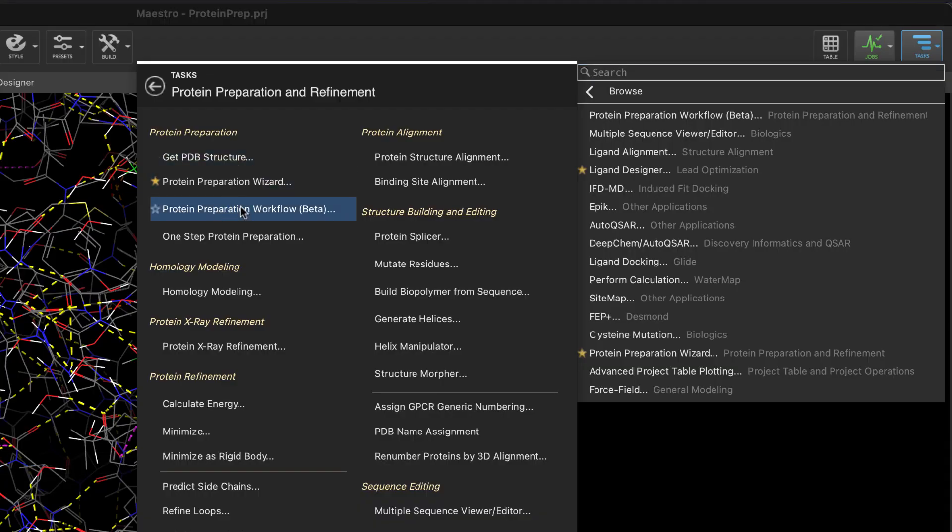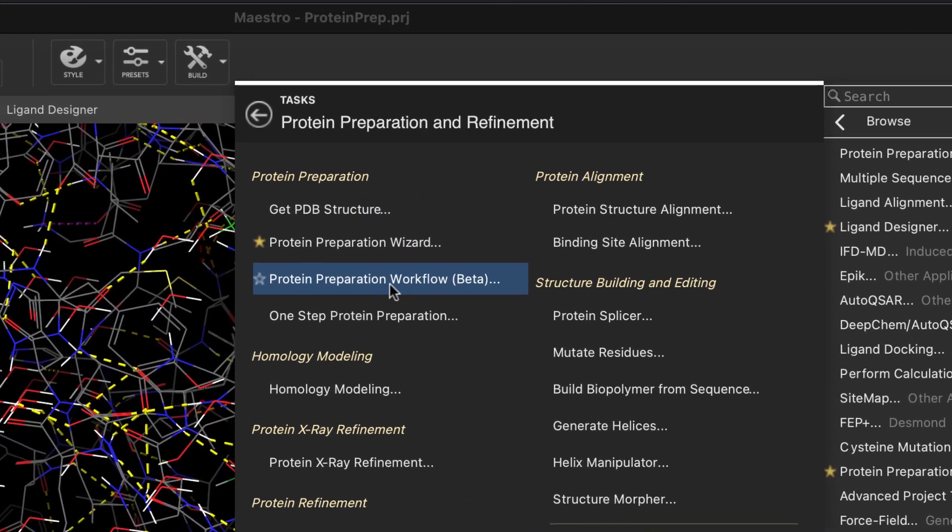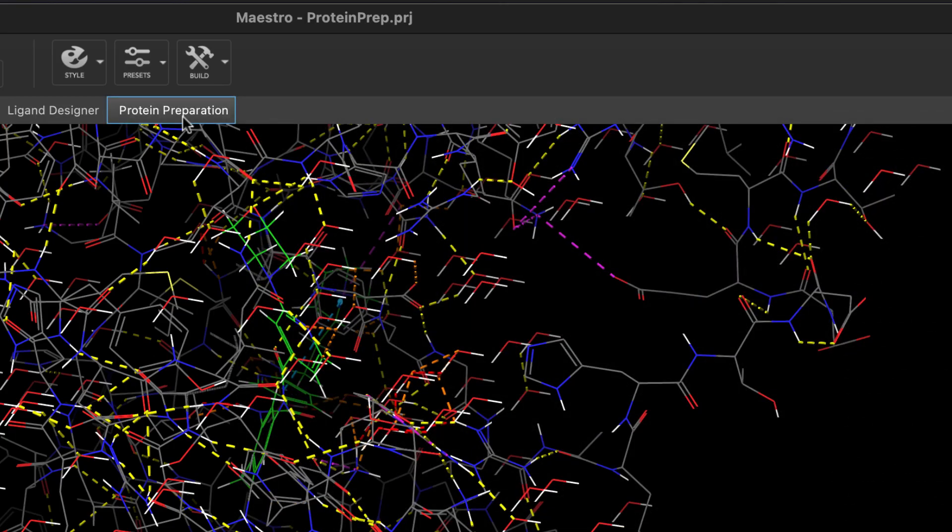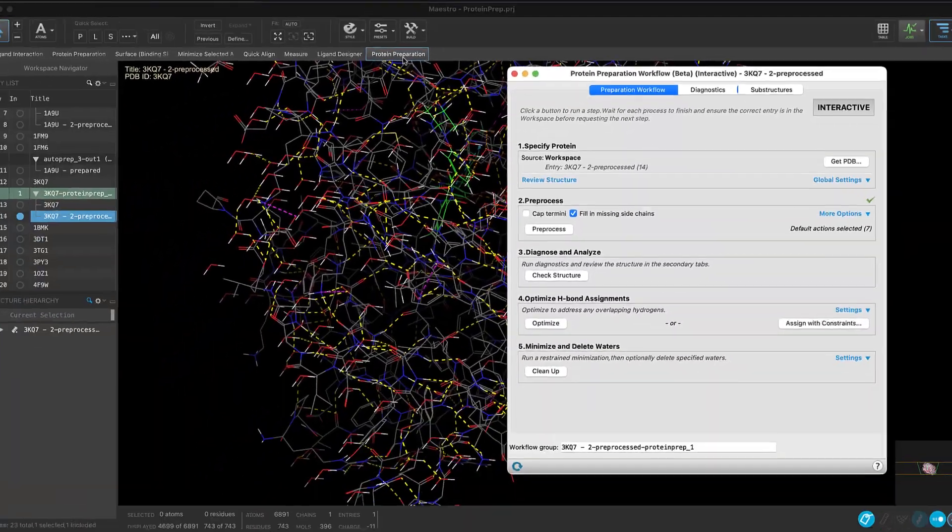The new protein preparation workflow can be found next to the existing protein preparation wizard. Feel free to favorite the menu item and to get one-click access from the favorites toolbar.